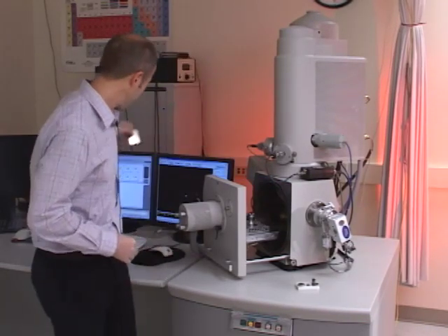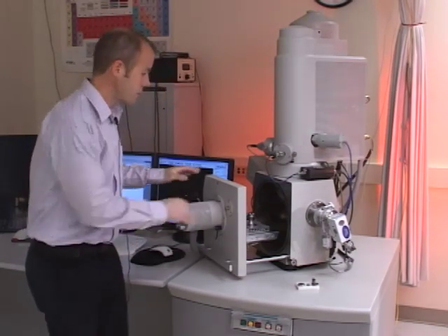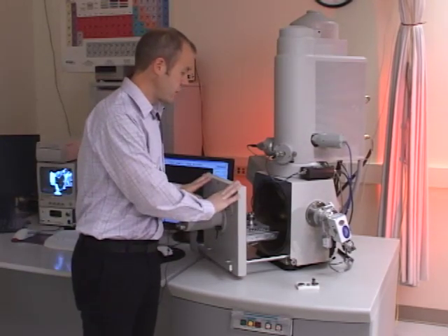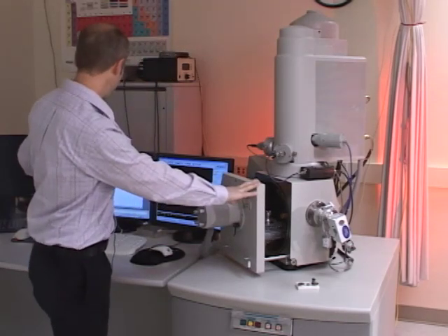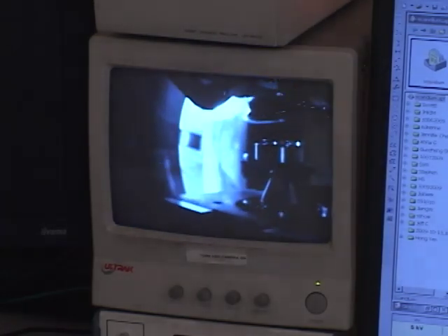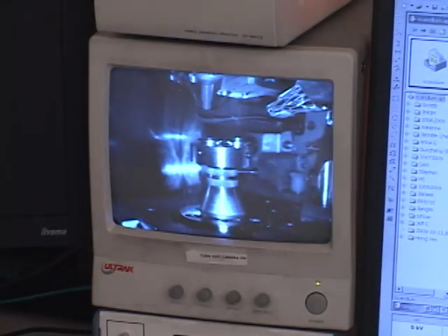So I'll just remove the elephant ear. And then I'll push the chamber door closed while I'm watching on the CCD camera to make sure that the sample slides in underneath the detector and it's not approaching the height of the detector.